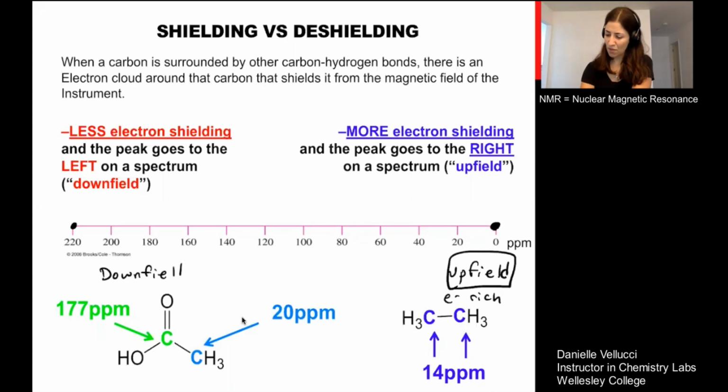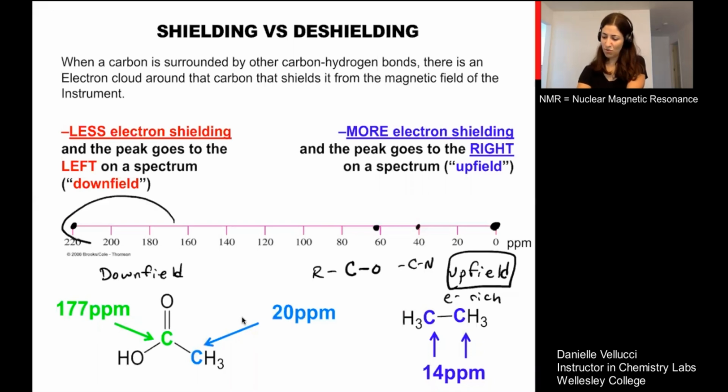Okay. And we tend to see that we move more downfield as we attach carbon to other electronegative atoms, such as oxygen and nitrogen. Okay, so the CO pi bonds tend to come in this region between 160 and 210. Okay, and this can be very helpful if you thought you had a carboxylic acid or a ketone, and when you get your C13 spectrum, you can look for a signal in this region, and it can help tell you something about whether or not you have that there.